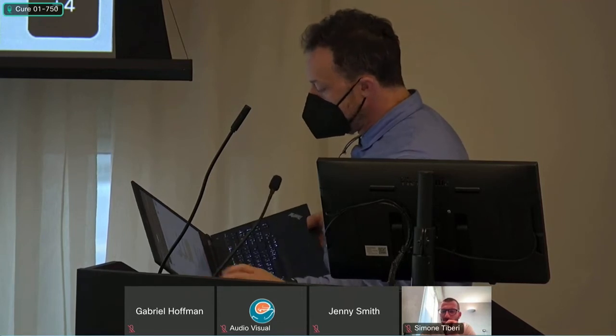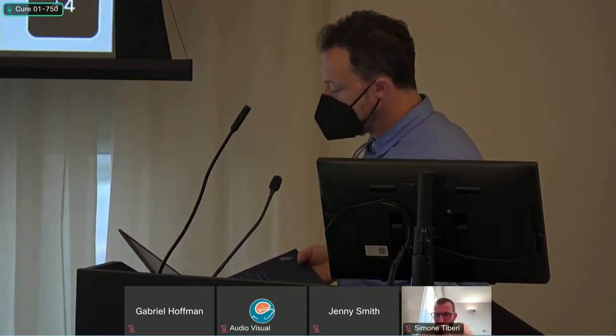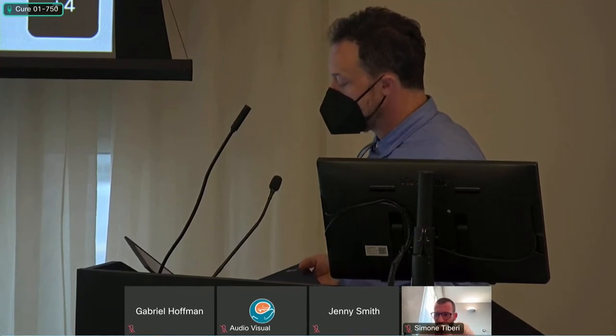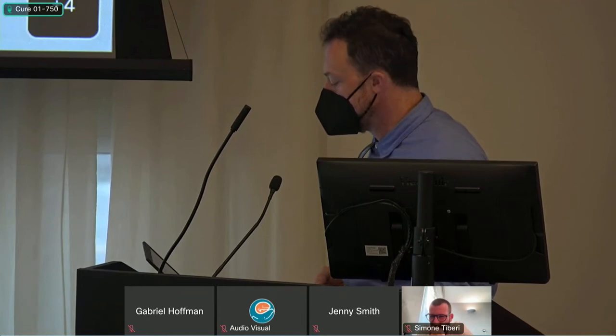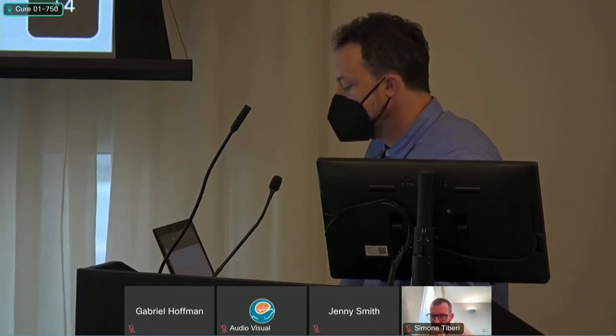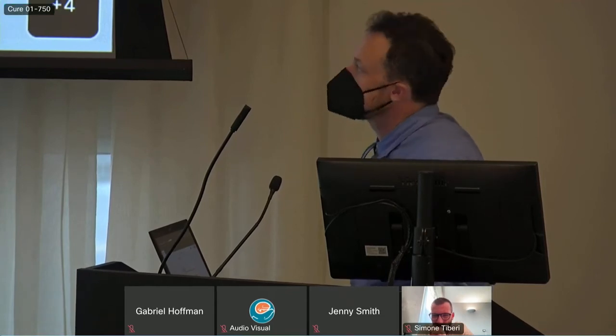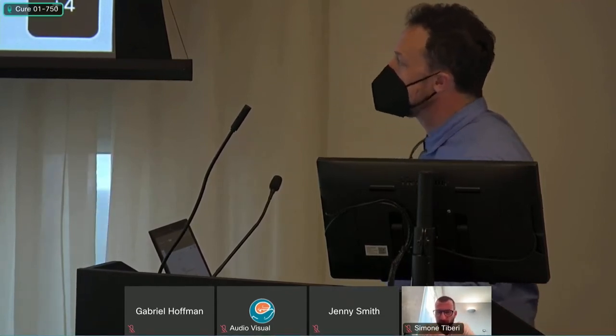From Ryan Thompson: In the past, I've simply run Salmon or Kallisto on the reads while including the unspliced transcript sequences in the reference, and just let the EM algorithm sort out the ambiguous reads in the same way as for alternative splicing. How does your method compare to this approach to splice ambiguous reads? So I guess what's the marginal benefit of properly modeling with a hierarchical model?